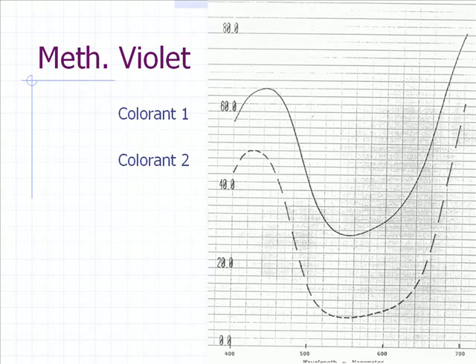And there's lots of things that can affect how strong it is, that we'll worry about in other classes. The question is, how much stronger is the difference? And there's an actual way of calculating that that we'll do in later classes. You can do that by getting the values of these reflectance values, generally taken at the lowest point, and then we compare them. They're proportional. You can figure out the strength differences.